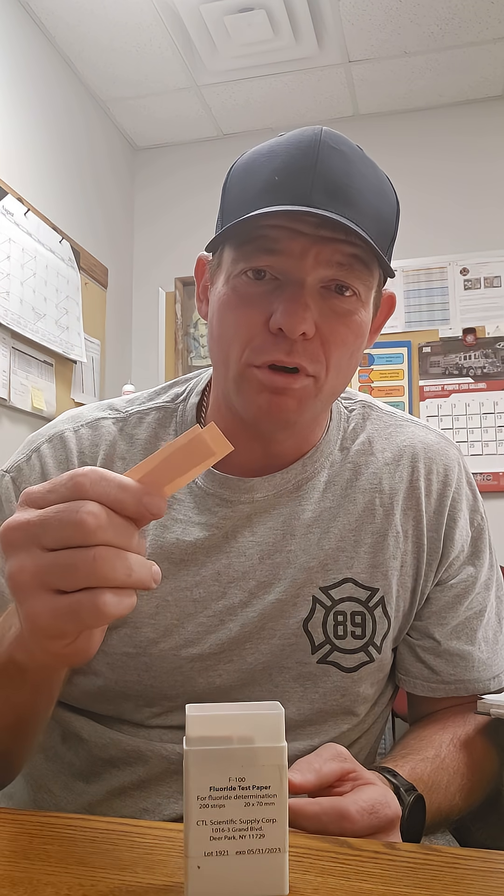The big thing about HF is it's highly corrosive. It's going to ruin whatever it comes in contact with — metal, ferrous material, whatever — and it's going to ruin your skin. The problem is the delayed onset: it's going to affect you later. We really need to know how much, if any, is in the air, and these are a wonderful tool that's not going to fail you.